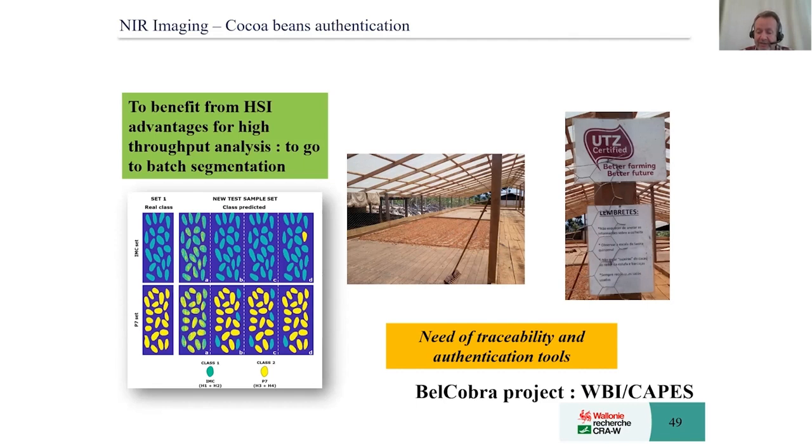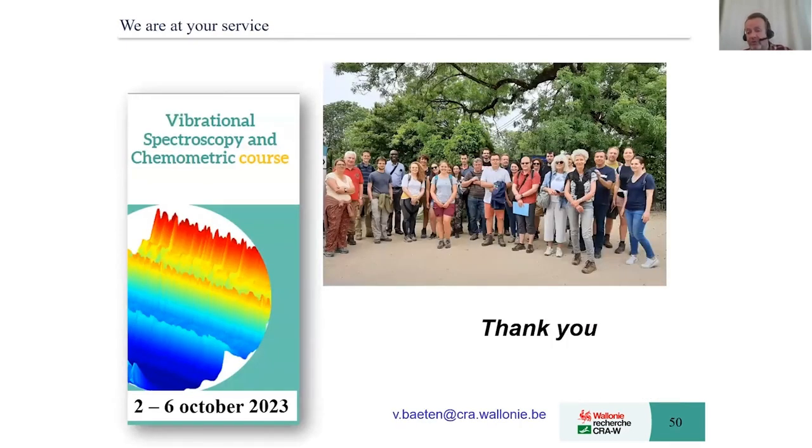I have some advice before going to the conclusion. Definitely, vibrational spectroscopy is very interesting. We can bring the lab to the sample, that's one for sure, but we have to be careful. You can do a lot of things, but you can also do wrong things. So what is very important is that you have to be sure and very robust over time in validation. When we develop models, for instance, the idea is not to predict the samples that you already know, but the product a week after, a month after, a new sample to determine the parameter. So in all the procedure, we have to be very strict, and we can help you in all the validation steps. That was just to give you a short overview.